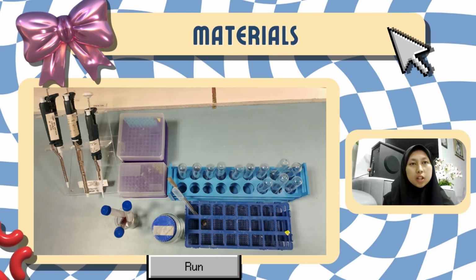In this practical session, the materials used is the distilled water, DNS reagent, Rochelle salt solution, standard glucose solution, 10 gram per liter, and also the sample solution. And for the apparatus, is the cuvette, glass beaker, hot plate, laboratory mixer, micropipettes and also the tips, spectrophotometer, and the test tubes and also the test tube racks.